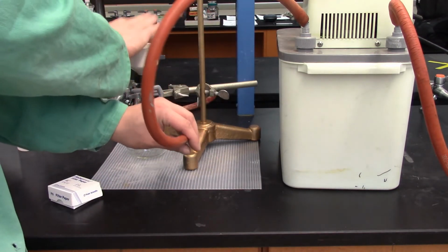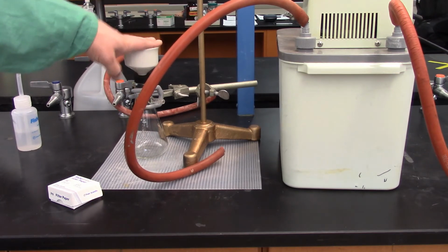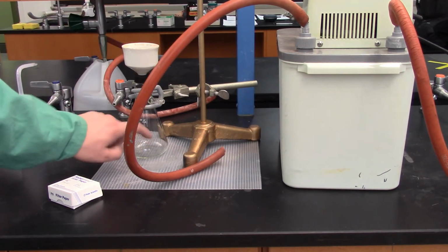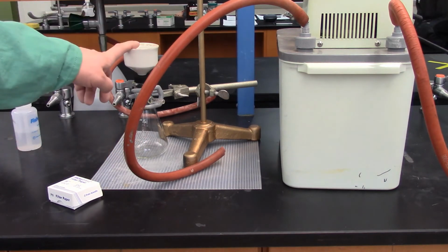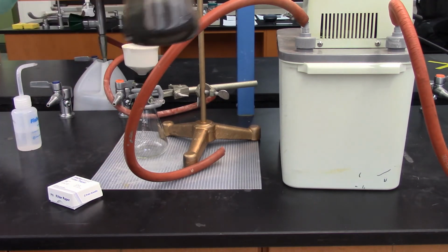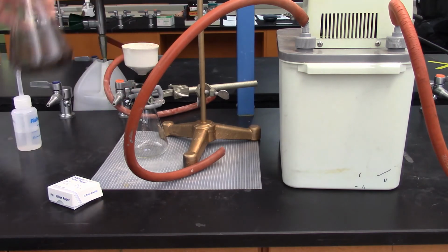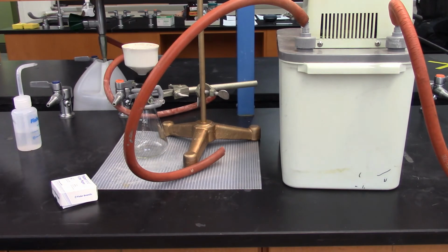So the pressure building up here, depending on how much solid or filtrate you're collecting, you can actually create this negative pressure, which will bring the water in the aspirator back into your solution. That's terrible if we're trying to just collect this solution, which we are trying to do. The first step is filtering off the impurities, the non-essential components of this ore. It'll filter it off. So I'll actually be getting rid of this filter paper in the first step of the copper ore lab and keeping the solution in the flask.